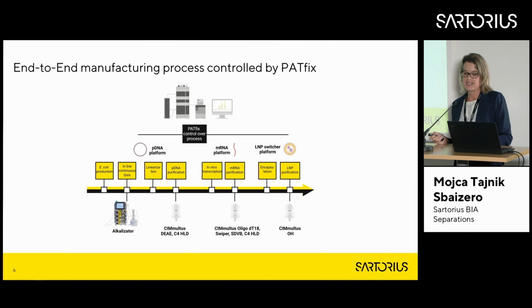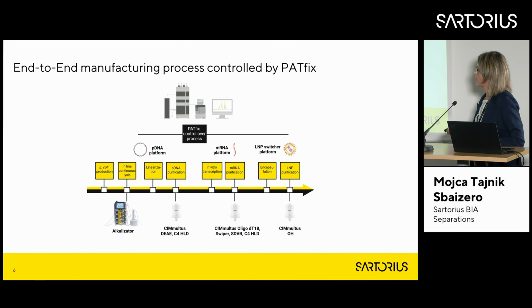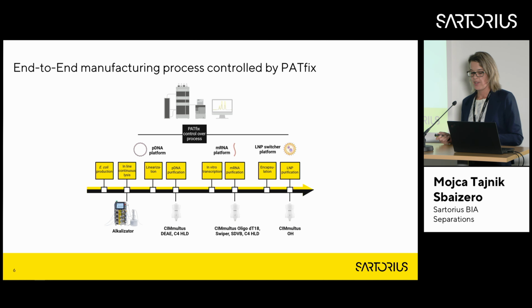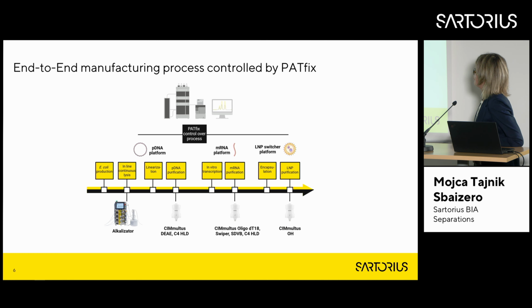So let's say we are at the last stage and we need to preserve all the work that was done here and several other analytic parts and production and especially design of the payloads and all this. And we need to be really careful not to ruin this at the very end of the process. So we need to have a really good LNP purification process to add to this scheme.